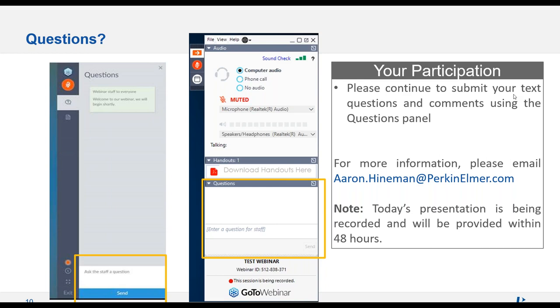Yeah, you said you just kind of started this during COVID, right? Yeah, we started it during COVID. It was Alex and I in the lab, and with the multi-collectors, he was like, oh, I can't get on the multi-collector, and I'm tuning up the instrument and I'm seeing 6 and 7 every time I do a mass cal, and I'm like, God, we could get it here.